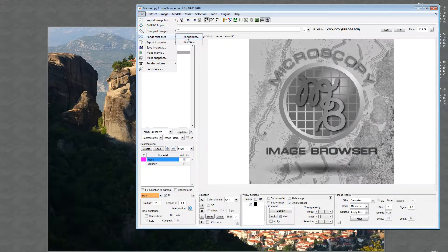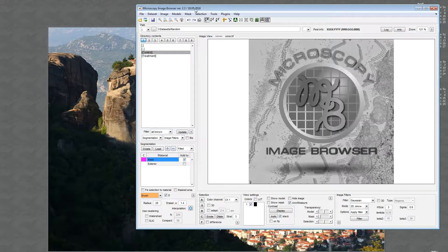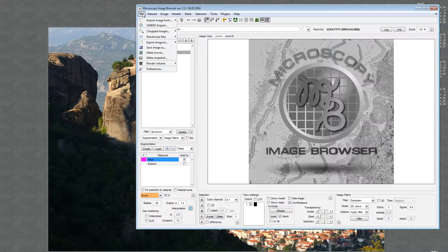Many of you who work with individual images — images taken under different conditions — may face the problem that when you analyze images, knowing which condition they came from, you get somehow biased. To deal with this, we are introducing these two tools that allow you to shuffle the files so that you segment them blindly, without knowing from which condition each file is coming.